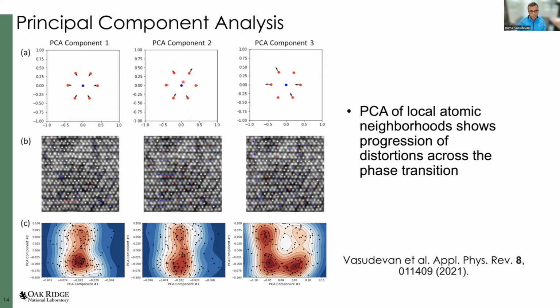We can also plot where this is occurring, in terms of the scores of the PCA component 2, and so you can see where this is larger and where this is smaller. And interestingly, there seems to be some kind of bifurcation. In other words, we see two different lobes in the intensities of this component, PCA component 2 with respect to component 1.